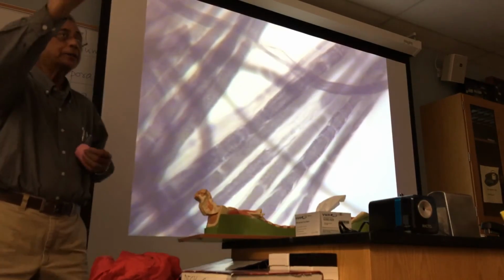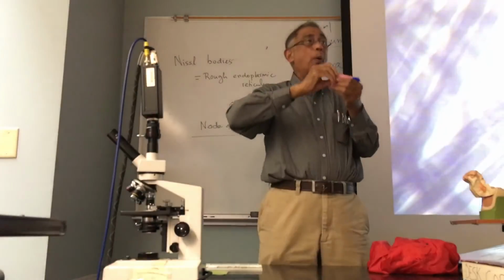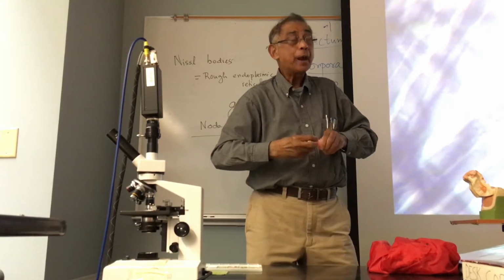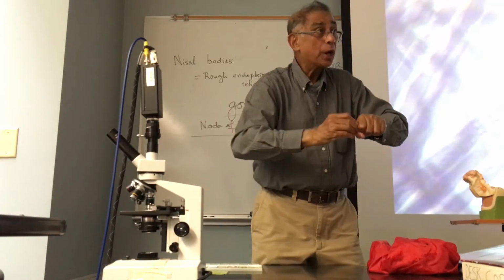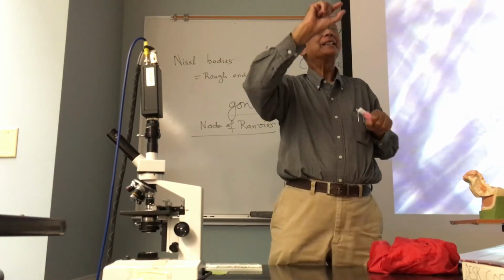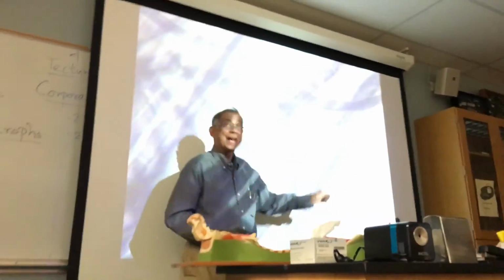I'll give you an example. This is a flat Schwann cell. This is the axon. Look at that. What does a Schwann cell do? It wraps around and around and around. When it's wrapping around, the cell membrane is wound around the axon. So you can see several layers of the cell membrane. That is the myelin sheath, and that is covered here. That's why this region is myelinated.